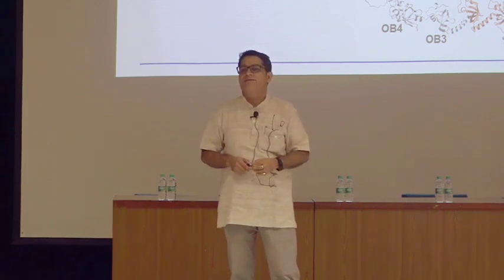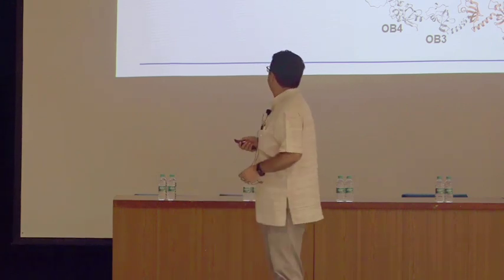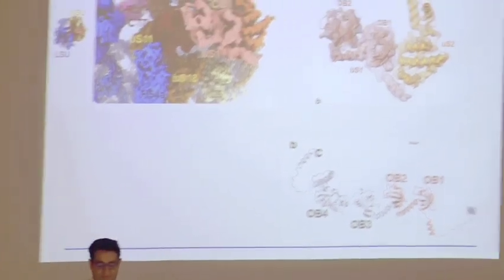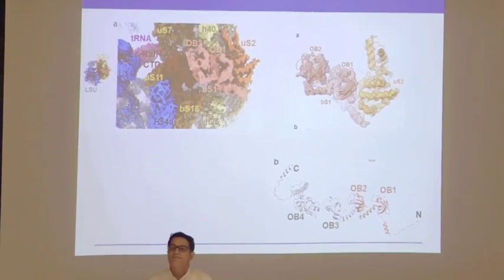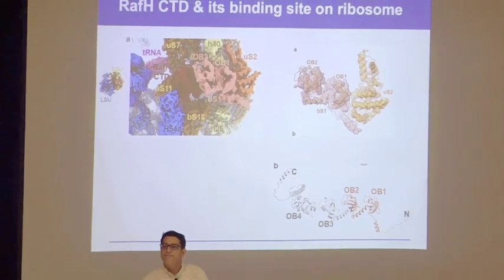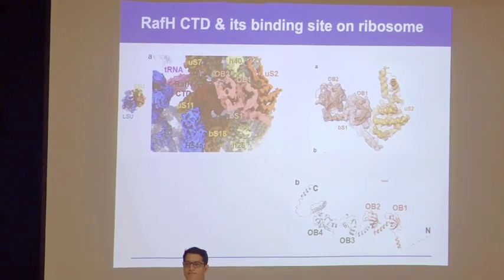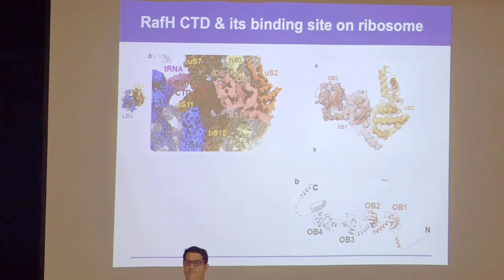The second was about when we modeled our myosin structure in AlphaFold. The motor domain structure was formed quite well, but the other domains in the tail region were unstructured. How can we use that AlphaFold structure for superimposition and look at the electron density, if we can get it from the cryo-EM images?